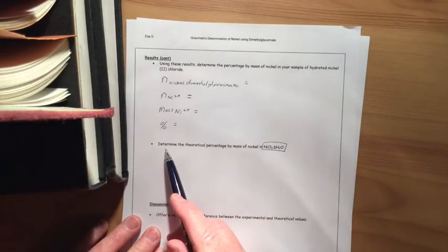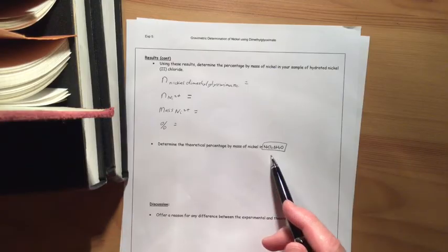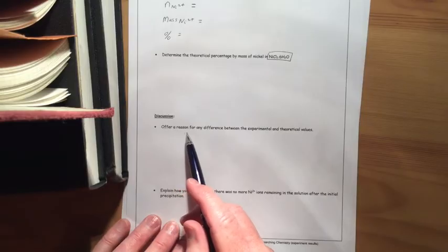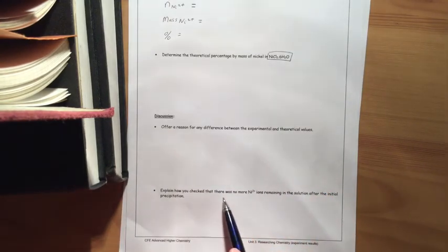Then compare that value with the theoretical percentage worked out using this formula for the hydrated nickel chloride. And in the discussion you've got to first of all offer up reasons for any difference that there might be between the experimental and theoretical values, and then finally explain how you checked that there were no more nickel ions remaining in the solution after the initial precipitation.